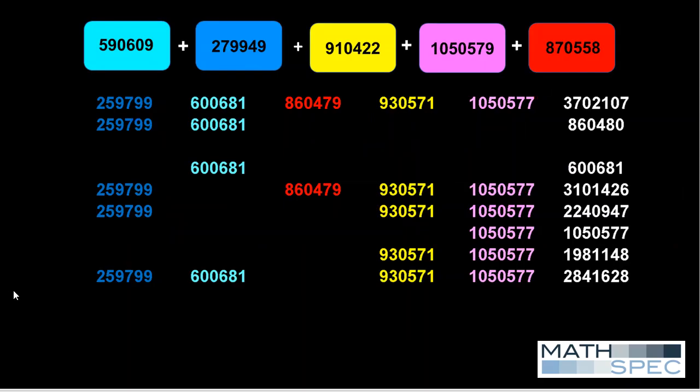So the top row here lists the exact masses of the 5 substructures of the compound. The ordering of the masses is not the same, and so color coding was used to denote the pairs of corresponding masses. The partitions derived from the mass spectral data usually will vary from the exact masses of substructures by the mass of an integral number of hydrogen atoms. You can consider partitioning as a form of elemental arithmetic that helps to interpret mass spectral data.